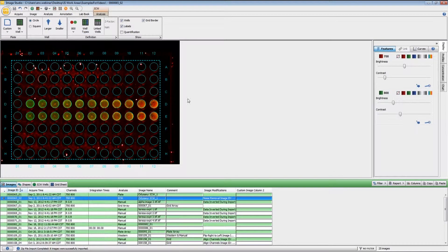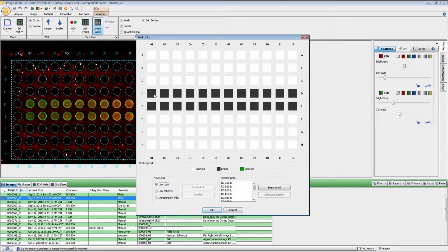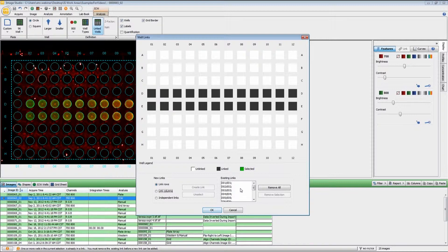Click OK. You can also create linked wells. If you have replicates — both of these rows are replicates — so if I click Linked Wells, I'm going to highlight all of those wells and then link the rows together. Now E1 and D1 are linked, D2 and E2, and so on. During the quantification and analysis, it will average the signal from both of those wells to come up with the appropriate calculations.